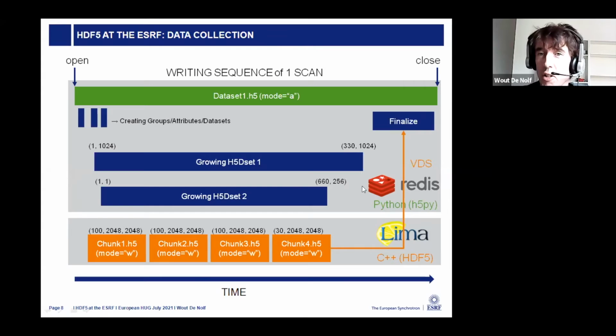So one issue here, unfortunately, is that virtual datasets cannot grow in terms of the number of sources. That means that if you want to do data analysis by using this file during the acquisition, you can't really use this as a single access point, at least not if you want to analyze the scan that is running. You can do it for the scans that have finished, but not for the one that's running, because we have to make the virtual datasets at the end.